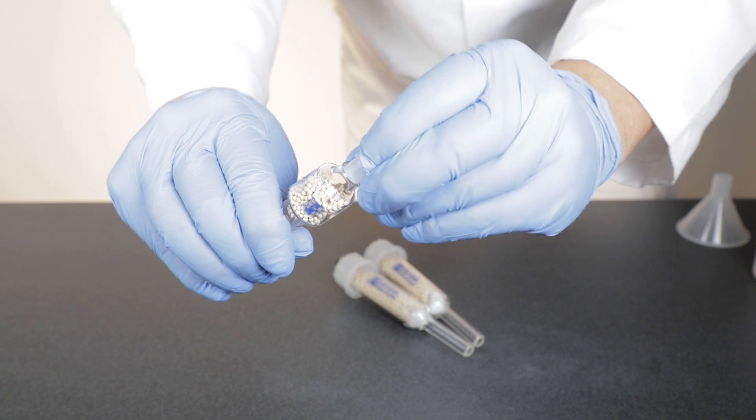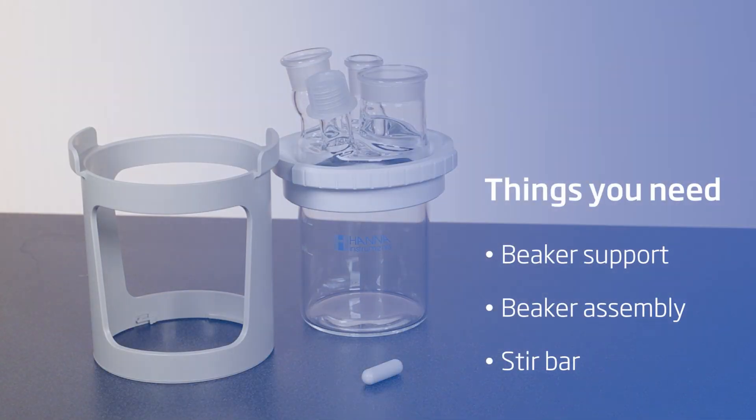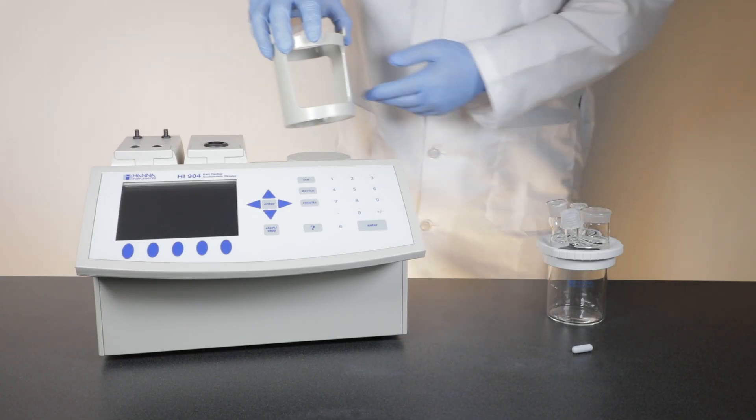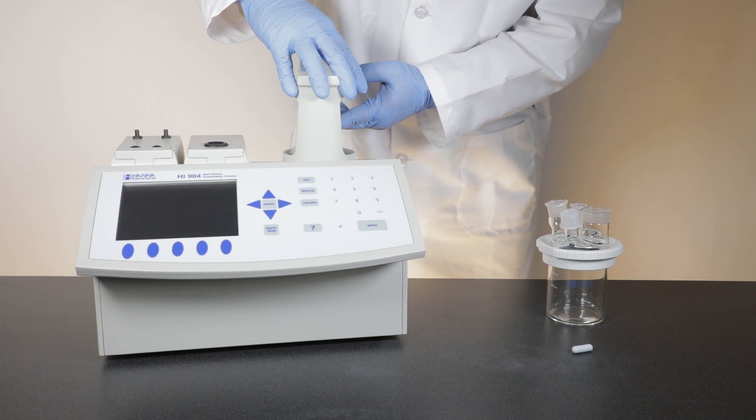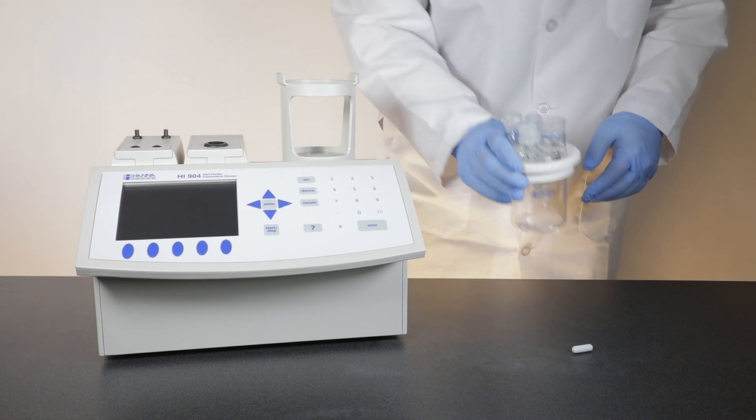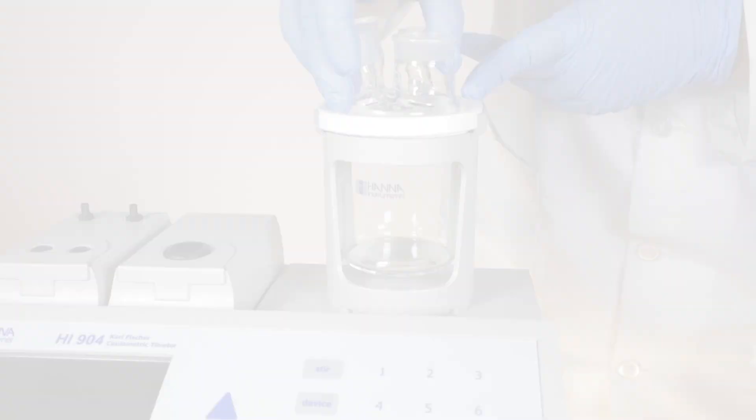Now we'll set up the beaker. You'll need the beaker support, beaker assembly, and a stir bar. First align the beaker support with the base plate and rotate clockwise. Then place the beaker onto the support and align the notches on top. Then add the stir bar.